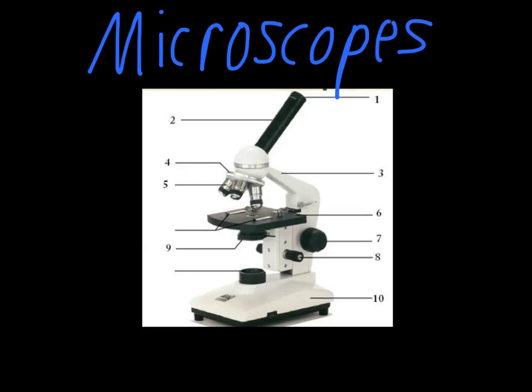The purpose of this video is to explain the parts and functions of a microscope. The very first part we're going to talk about is the ocular lens up here at the top. This is also referred to as the eyepiece. For the microscopes that we have in class, this gives you ten times magnification.